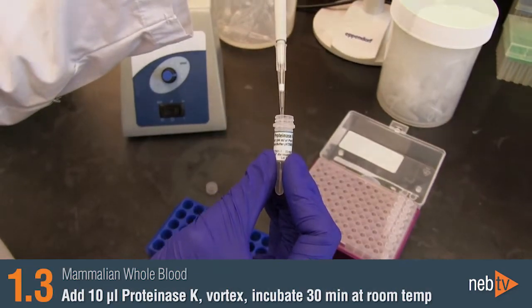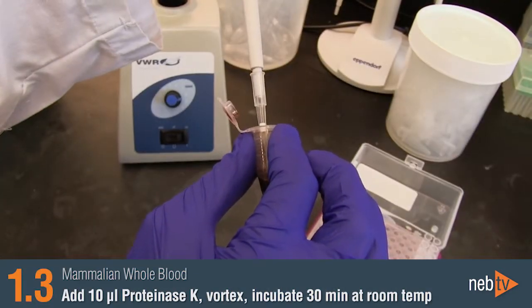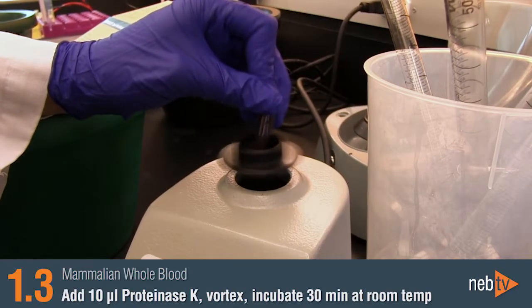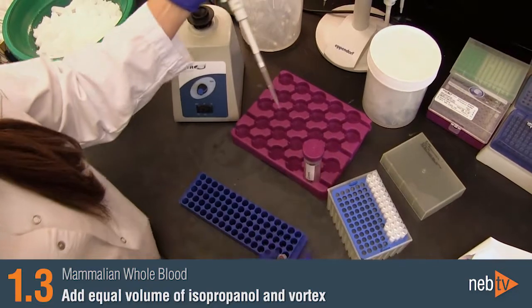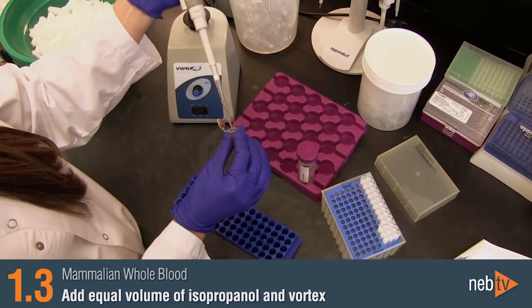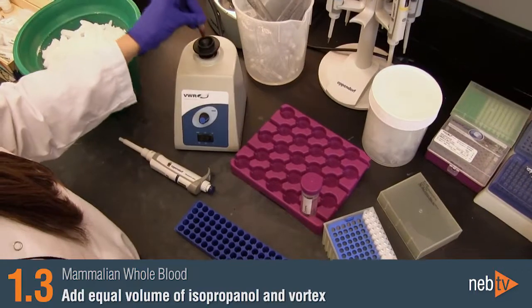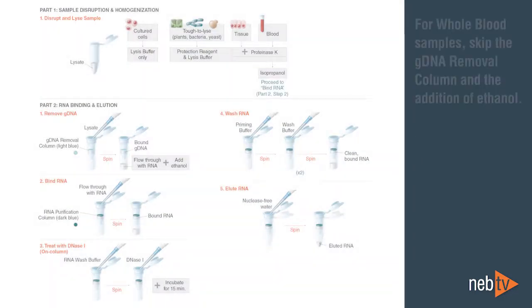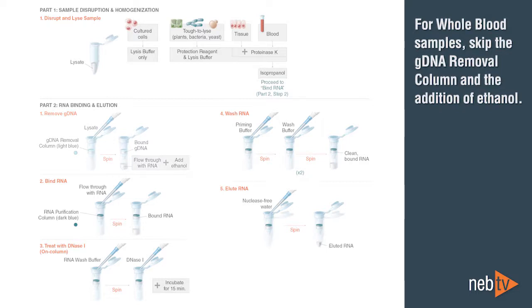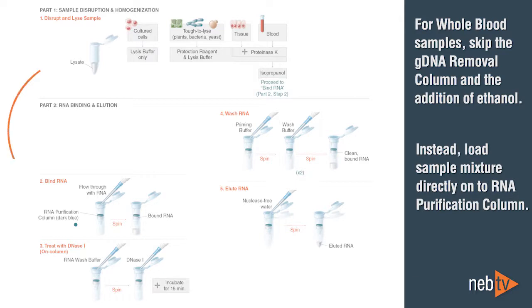Add 10 microliters of Proteinase K to the mixture, vortex briefly, and then incubate at room temperature for 30 minutes. Next, add an equal volume of isopropanol to the sample and vortex briefly. Now you are ready to move on to the RNA binding step in Part 2. It is important to note that for whole blood samples, you will skip the gDNA removal column and the addition of ethanol, and instead load the isopropanol sample mixture directly onto the RNA purification column.